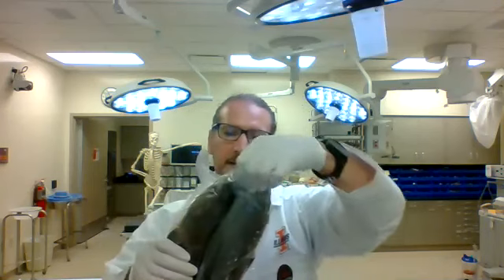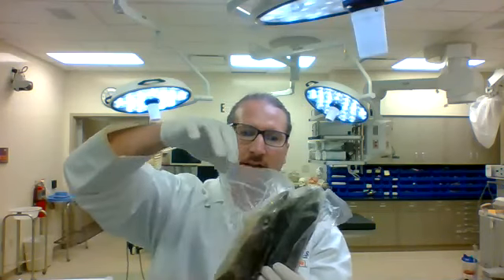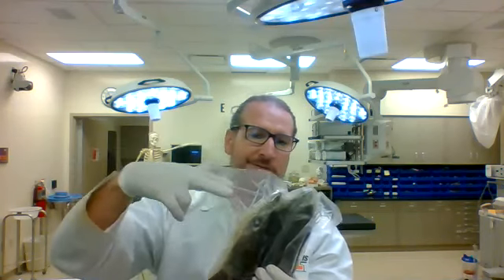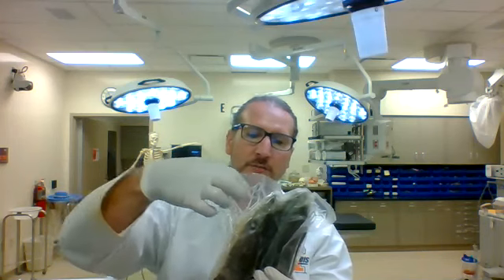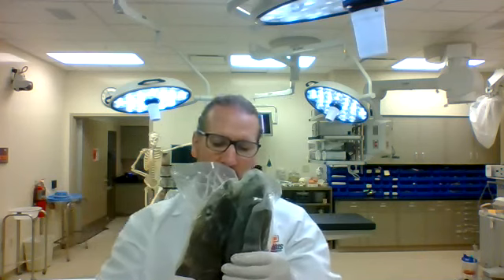But don't do anything yet. When you cut it, you can see the seam along the top. Just cut just below the seam just so it opens up. Once you puncture this, the vacuum will break. You're going to cut along, open it, dump out the juice.